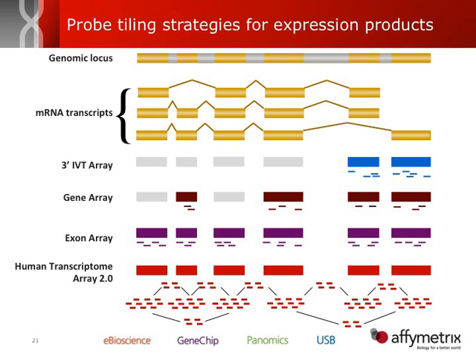So I'm going to walk you through this really quickly. If we take this first isoform here at the top, we can see that we have exon number 1, exon number 2 is spliced out, and then exon number 3 is retained. So what we'd expect to see on the Human Transcriptome Array is signal from the probe set that interrogates exon number 1.